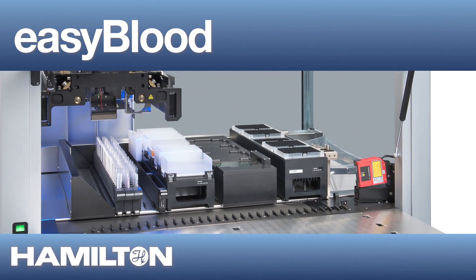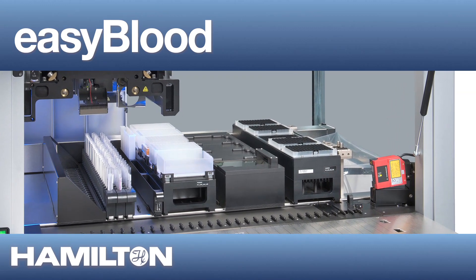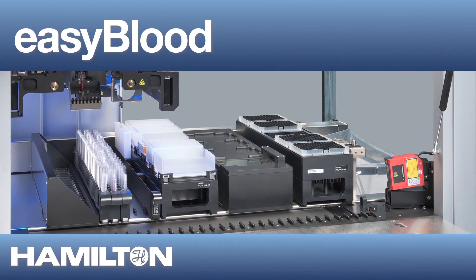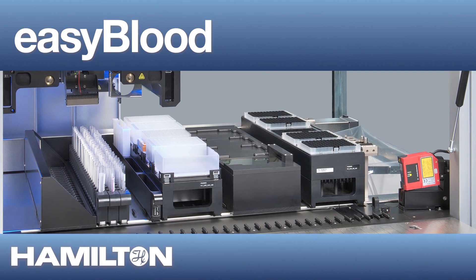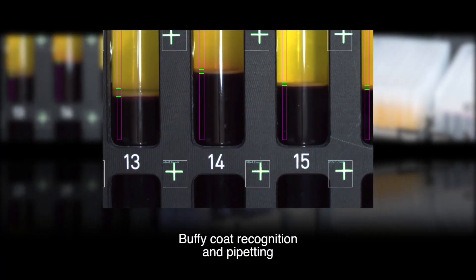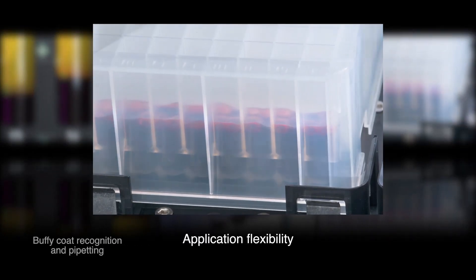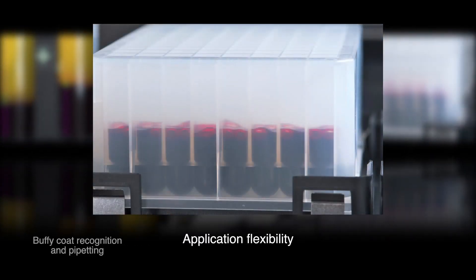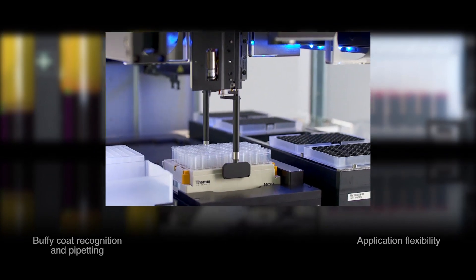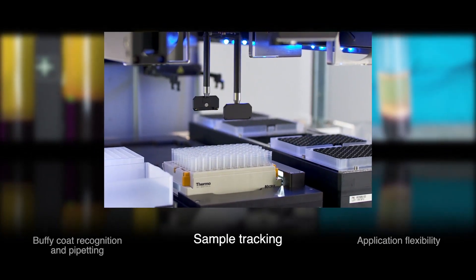offers you the possibility to fractionate blood samples from a multitude of primary sample tubes to storage-ready or processing target labware. EasyBlood automates error-prone manual pipetting and aliquoting steps by automatically identifying the separation layer of blood samples and then reliably pipetting the desired layer.